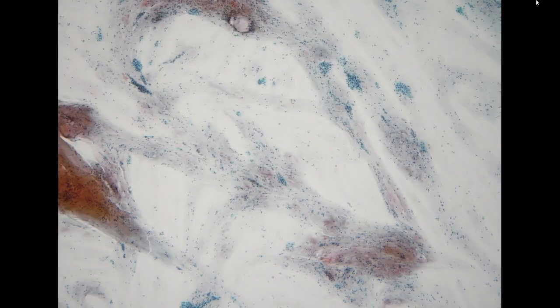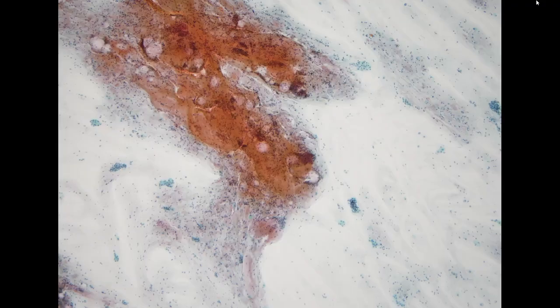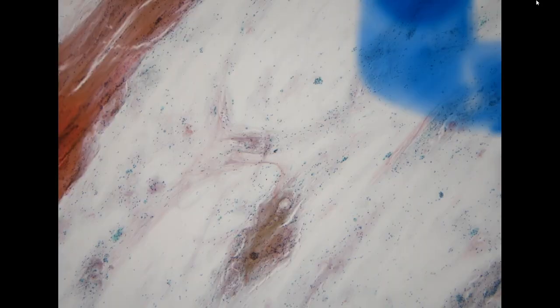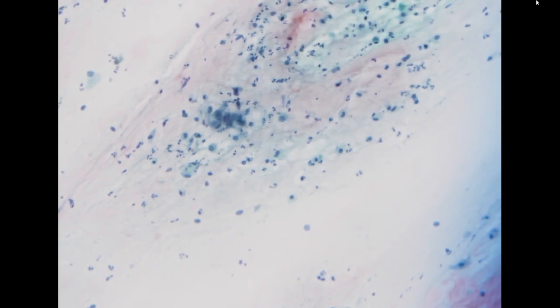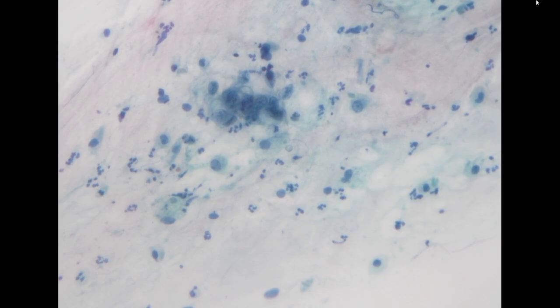Although the pap smear is the tool for identifying cervical cancer and cervical precancer, sometimes we can still detect endometrial lesions from the pap smear, usually from the bleeding and the debris from the endometrial cavity that is stuck inside the vagina. And sometimes the sampling can also sample the endometrial elements.